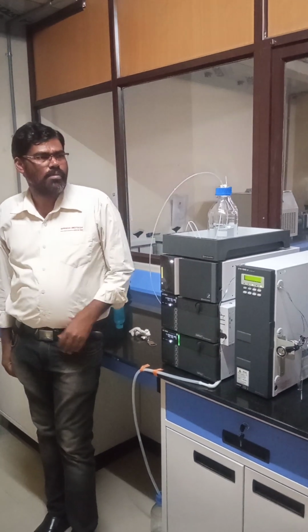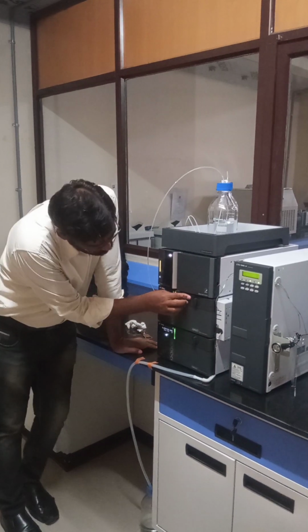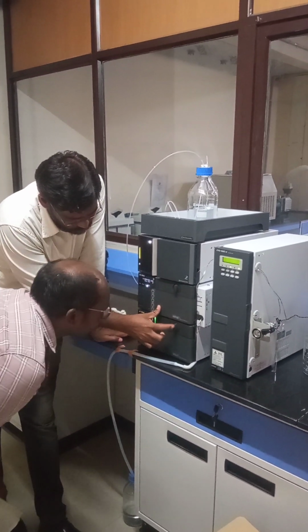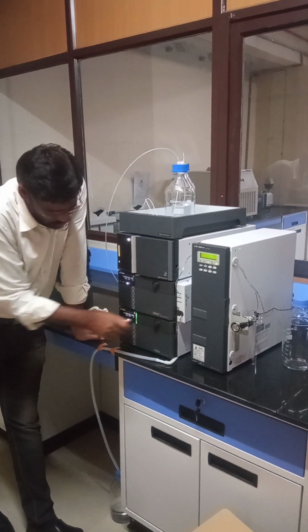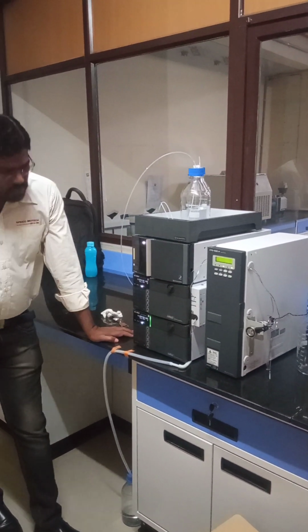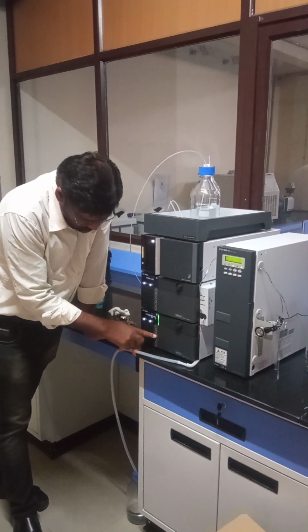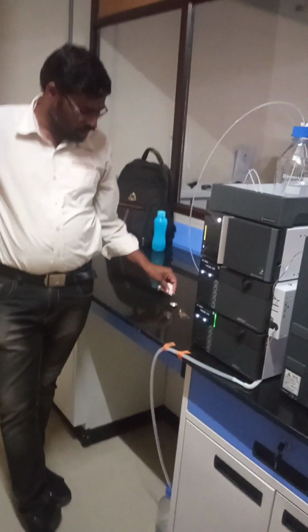The purge valve has a label. What you open is always the left side. Open the purge valve. Press the purge button, pump A and pump B; we should not forget either one.